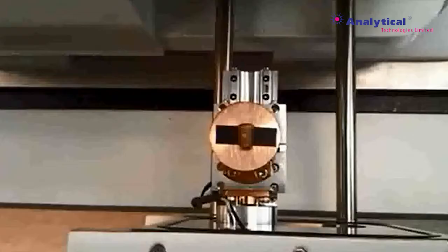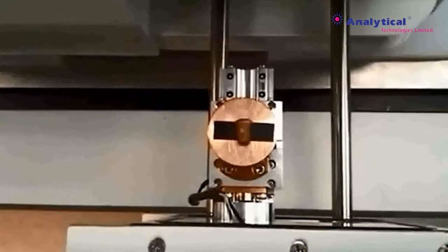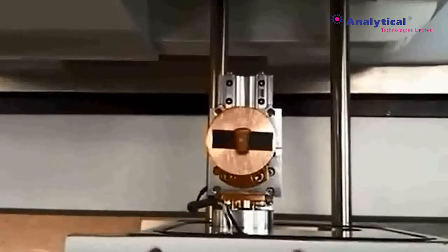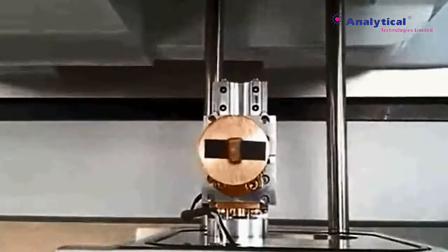About the sample position. The direction you see when you see the sample from above will be shown on the screen. Therefore, consider the direction when you load the sample. After the sample is secured, switch the chamber to vacuum state by pump. LED bar will also increase correspondingly with the degree of vacuum.